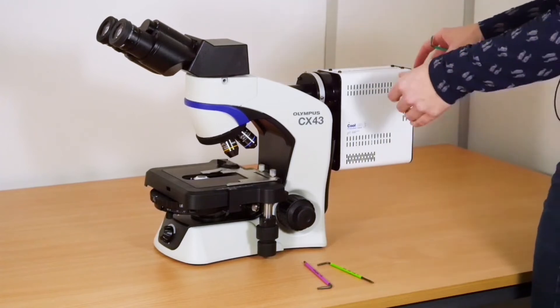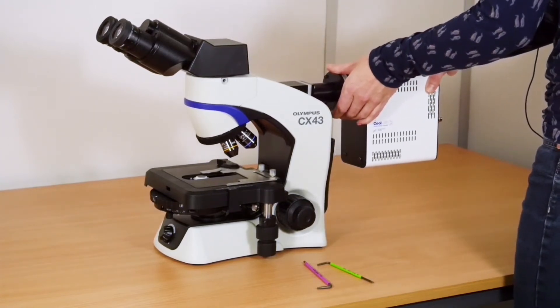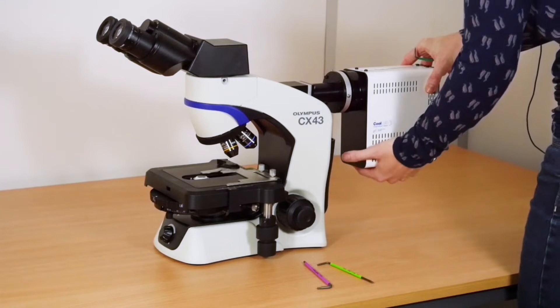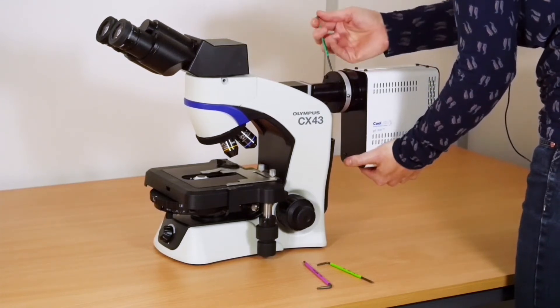When you come to removing the adapter, gently pull the adapter out from the microscope, fully supporting the light source. Loosen the grub screws.